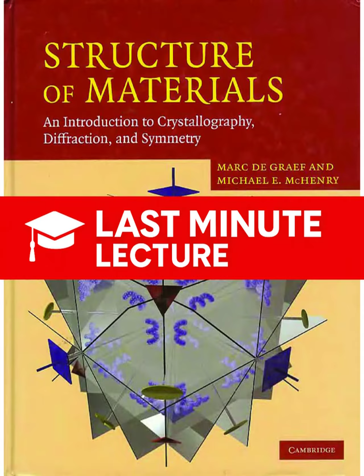To expand that limiting sphere and access those fine structural details, they need to shorten the wavelength, lambda. This requires X-ray sources capable of delivering much higher energy photons, and that often necessitates a trip to a major research facility, a synchrotron, where electrons are accelerated to near light speed, generating ultra-high energy short wavelength X-rays capable of reaching the furthest corners of the reciprocal lattice. The geometry always holds, and sometimes the solution to a technical problem simply requires a bigger machine.